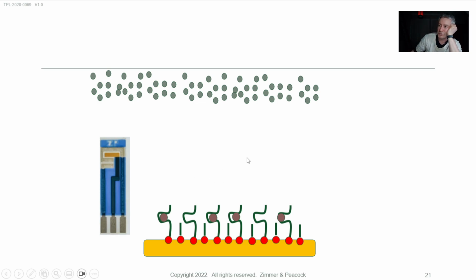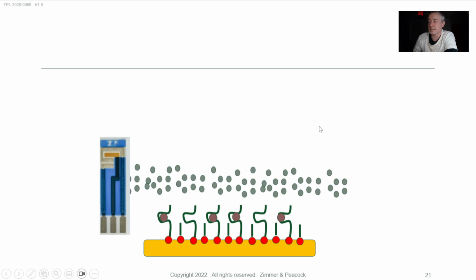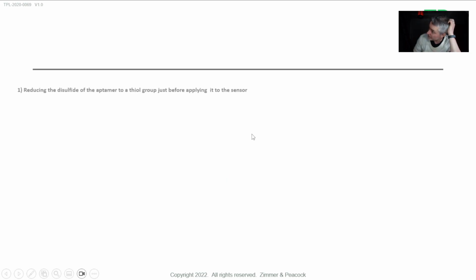And then we often run our assays in quite a simple way, where we just use something like ferrocyanide, and we're essentially trying to get to the surface, but the surface gets blocked by the binding. Be careful when you're making SAM layers. Make sure that your thiols are actually not disulfides, but true thiols.